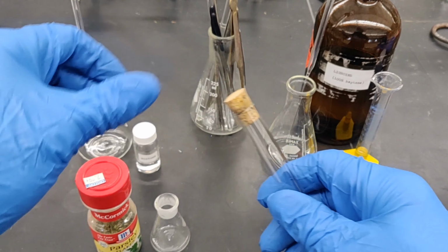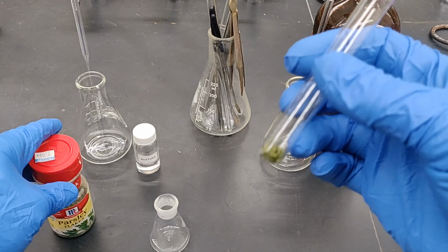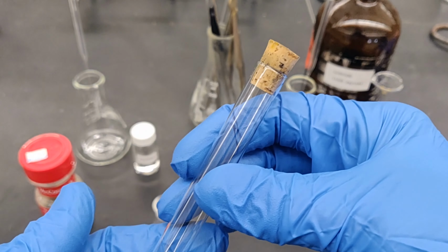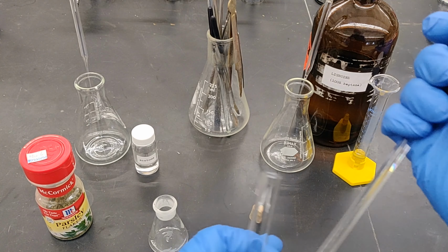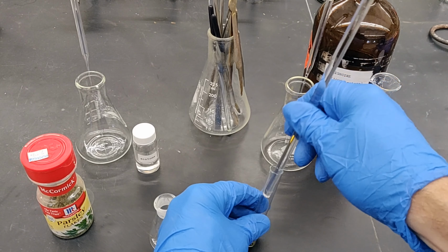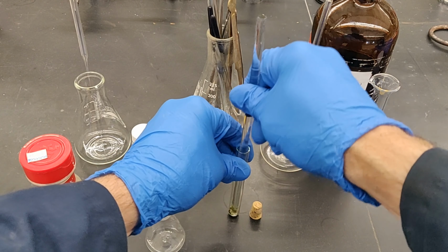Begin with the pigment extraction. 50 milligrams of dried parsley leaves are used in this demo. If the dried leaf flakes are large, as in this case, briefly grind them into smaller fragments, as shown here, to increase the solid surface area for a more efficient extraction.